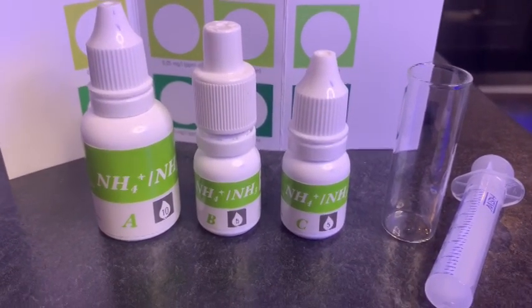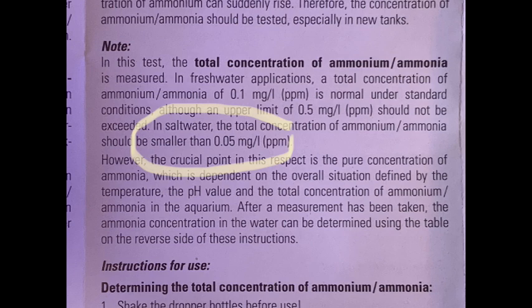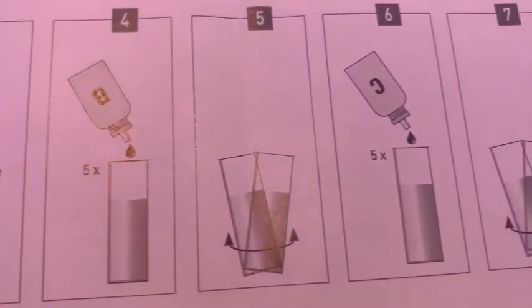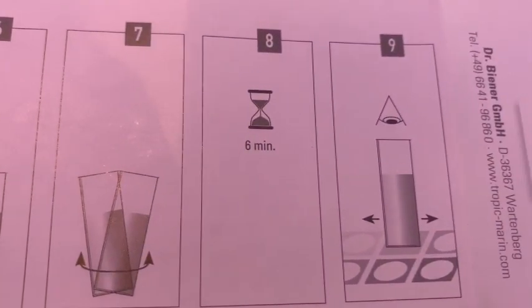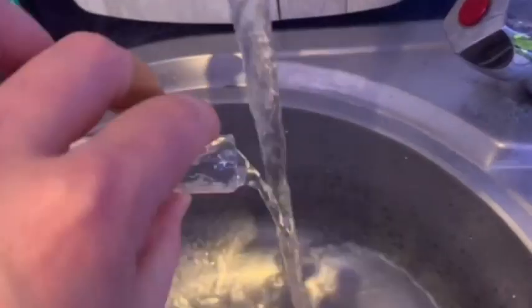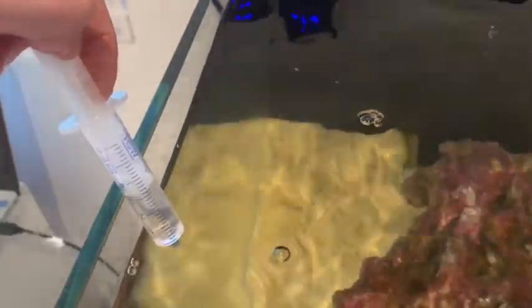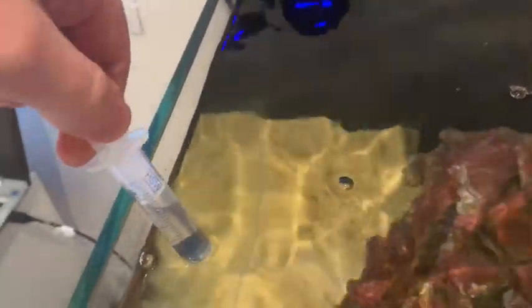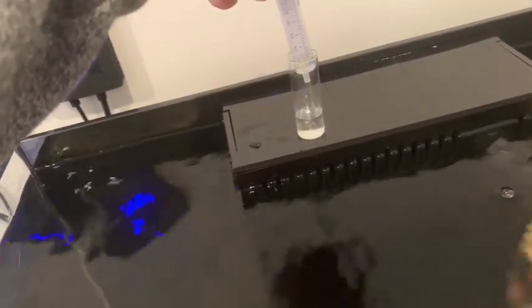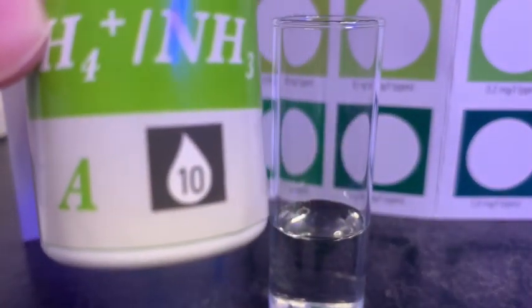Here's the ammonia test kit, and it comes with some simple instructions, parameters to aim for, and even some good diagrams to make it all a little bit easier to understand. Your first step is to make sure that each bottle is really well shaken. It then says to rinse your vial out with fresh tap water, then do the same with your tank water, and then with the included syringe, draw up five mils of tank water and deposit that into your testing vial.